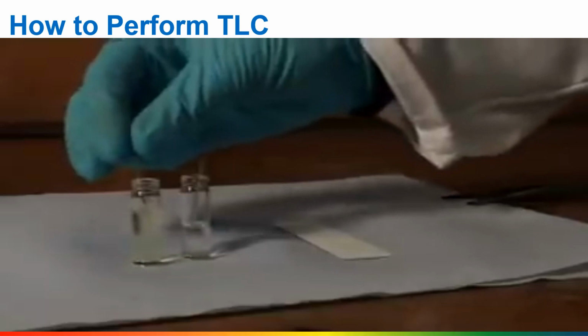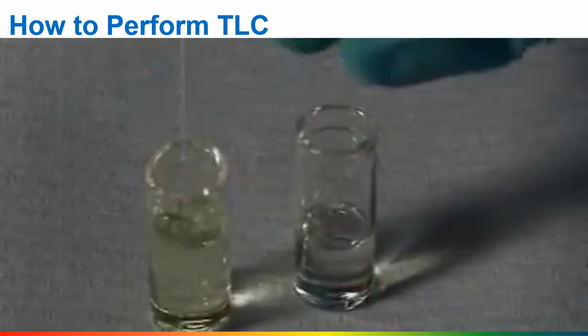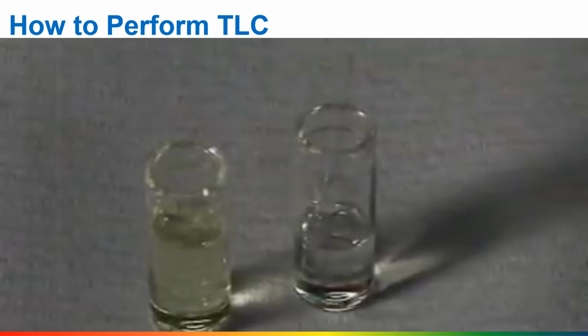We've drawn a pencil line at the bottom of the plate with three marks on. We're going to spot one of the samples on the left-hand spot and the other on the right-hand spot. We've put a spot of each compound on the middle co-spot so we can compare their RFs.